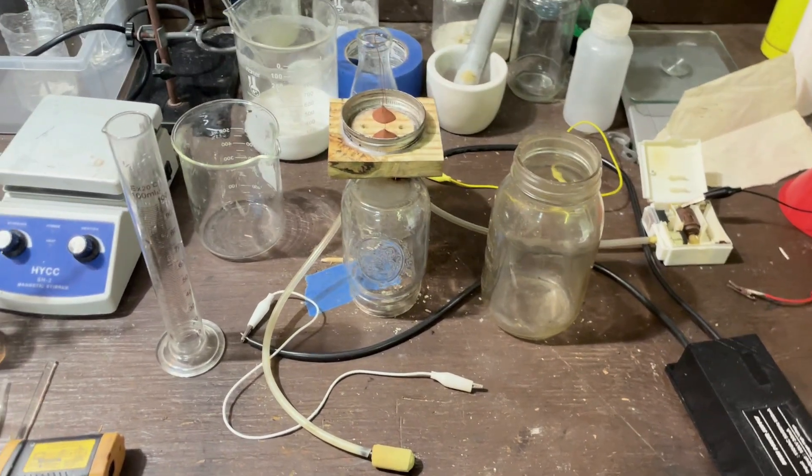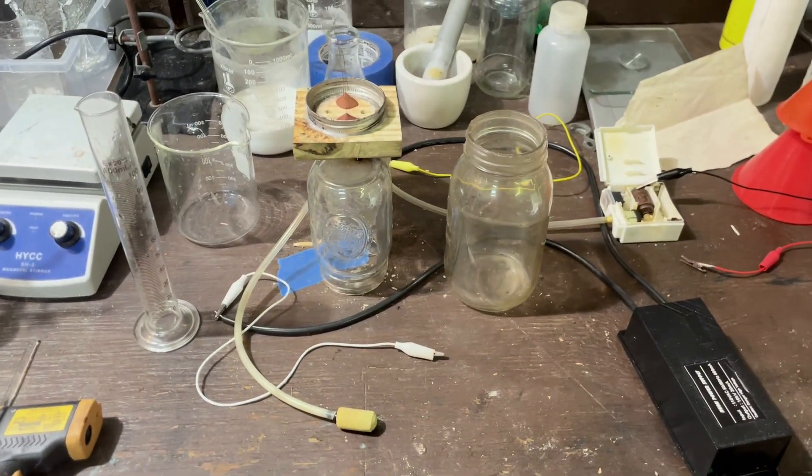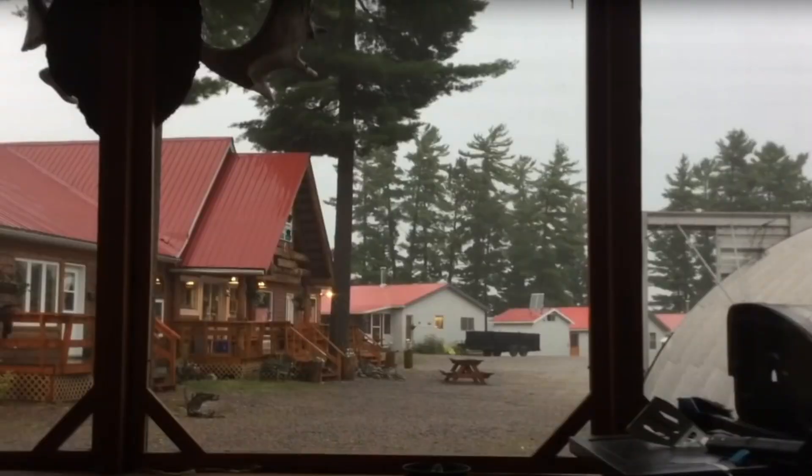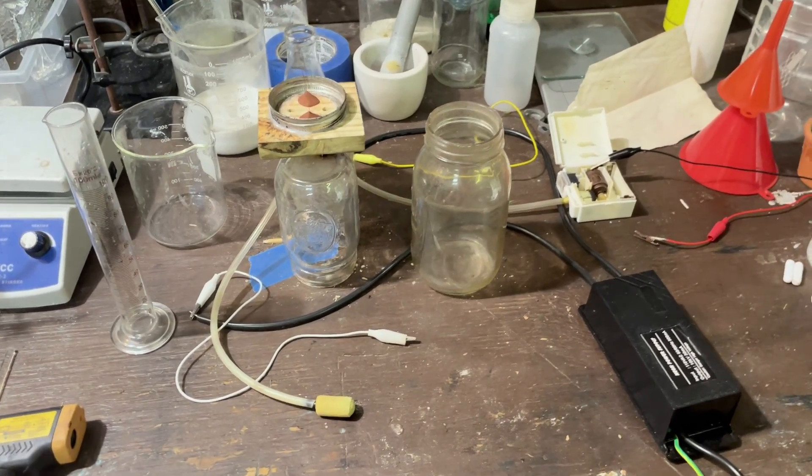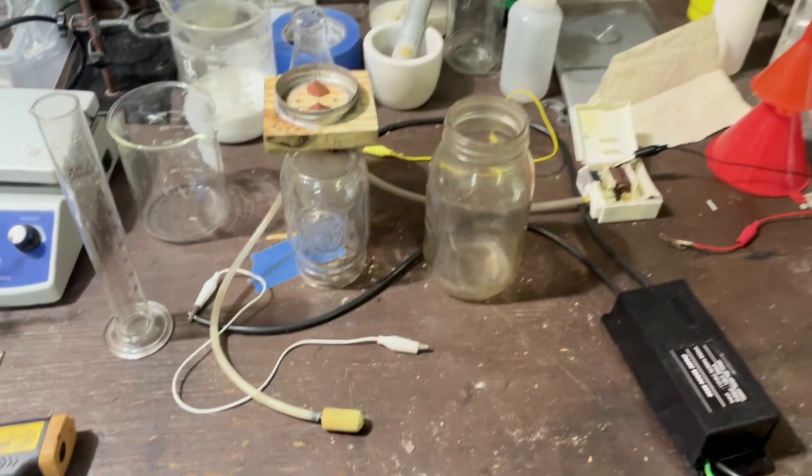Hello, everybody. Today I'm going to be making some nitric acid with lightning. Well, not really lightning, but high voltage — a high voltage arc.